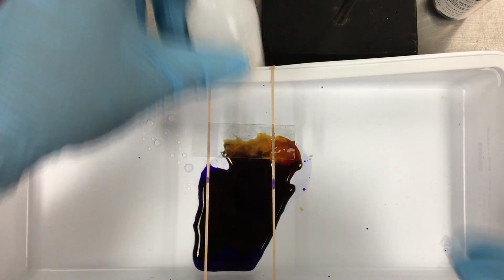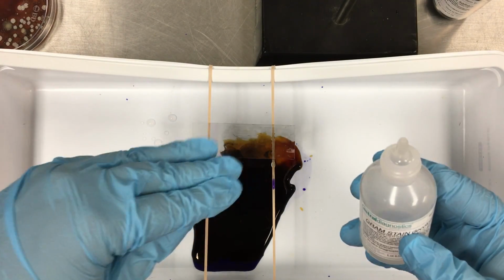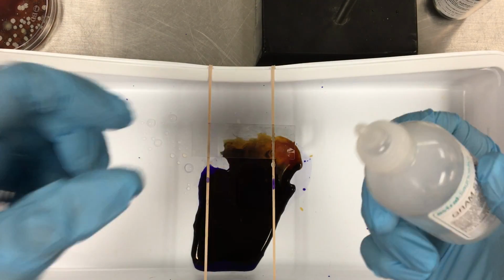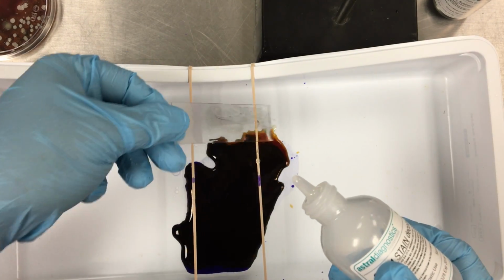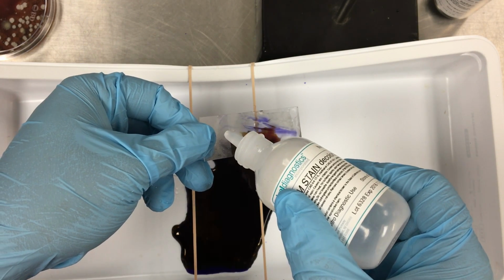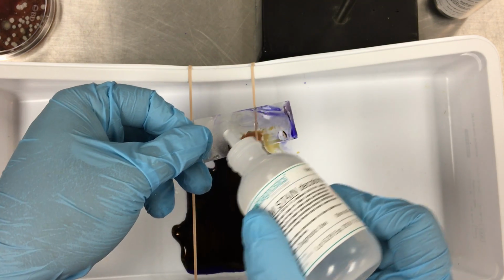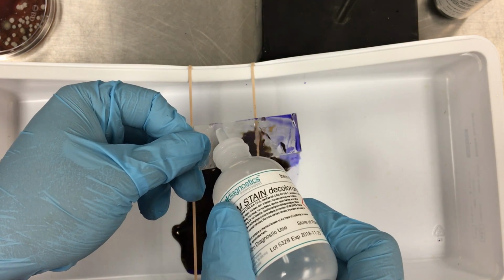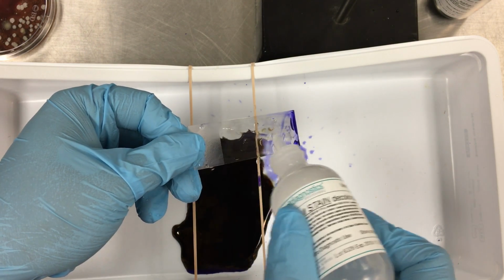The third step is the acetone decolorizer, and this one is done differently. Rather than flood the slide with it and let it sit, we're actually going to drip it on. So I hold the slide up at an angle and put one drop at a time and let it just run down the slide. And I'm going to continue to do this until everything that's running off is clear.